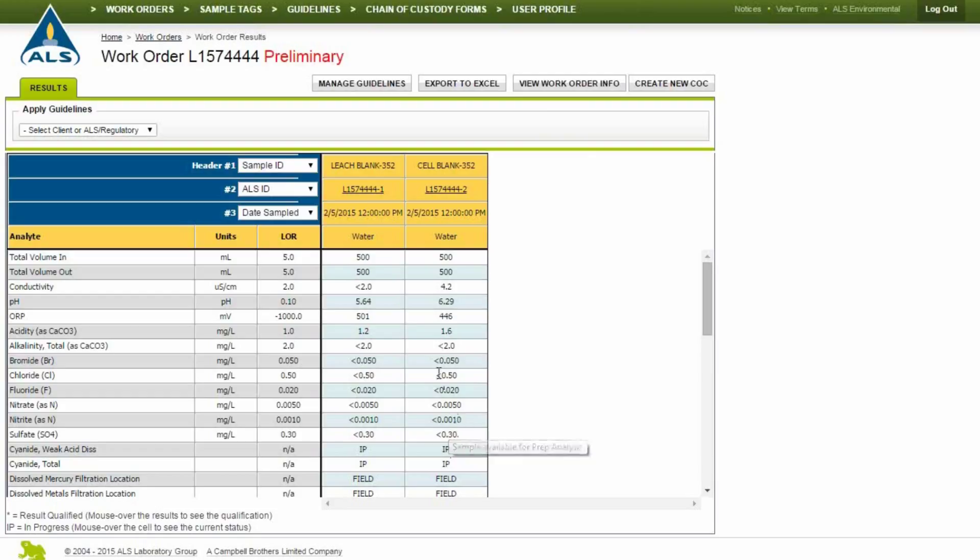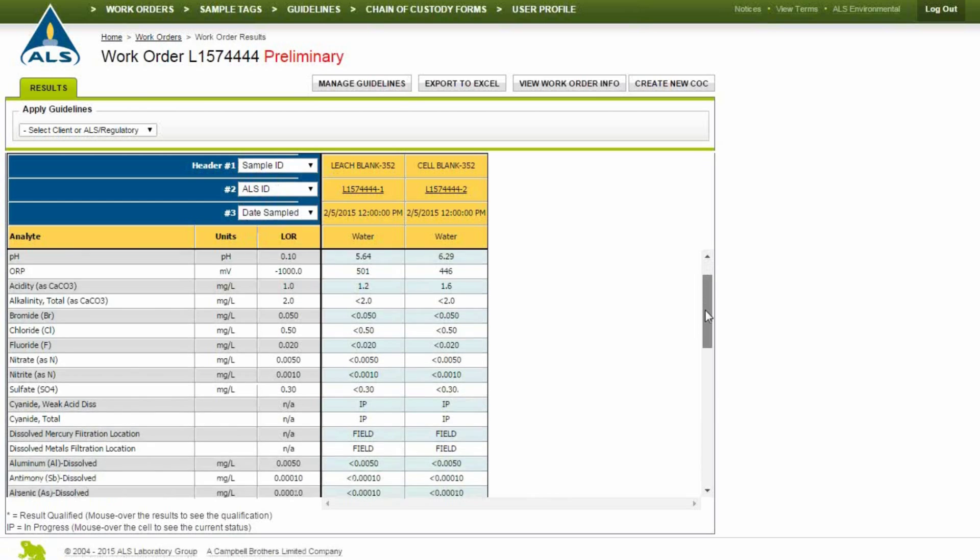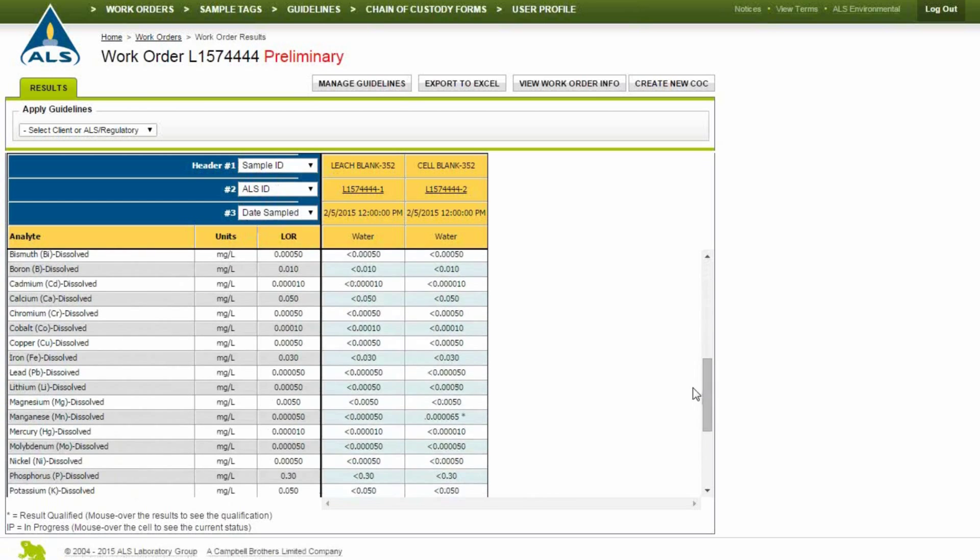To filter by a specific result, select an option from the header drop-down menus. Results marked with an asterisk are results that have been flagged by the laboratory. Mouse over the cell to see the qualification.